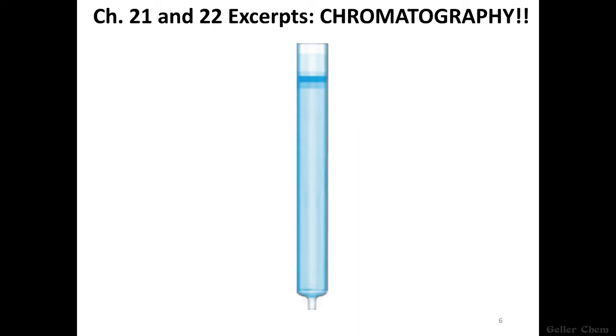Here it is, our final analytical technique, which we will be learning about by taking pieces from chapters 21 and 22, and that's all we have time for in the rest of this class. So this technique is called chromatography.